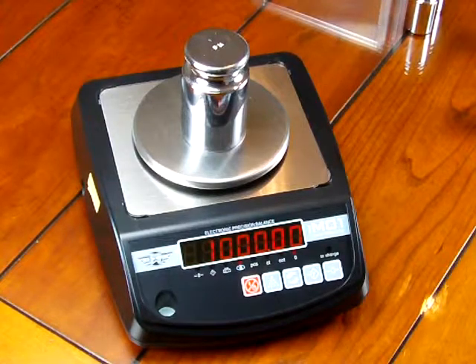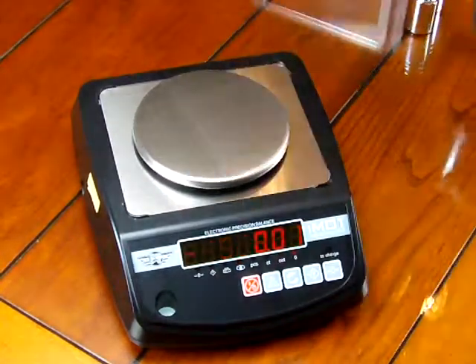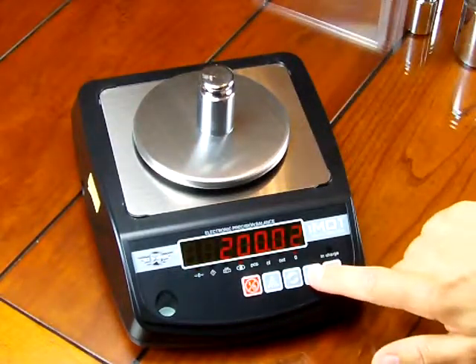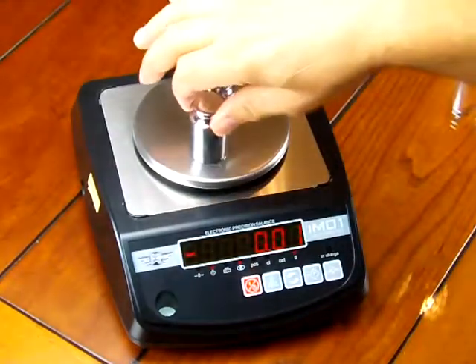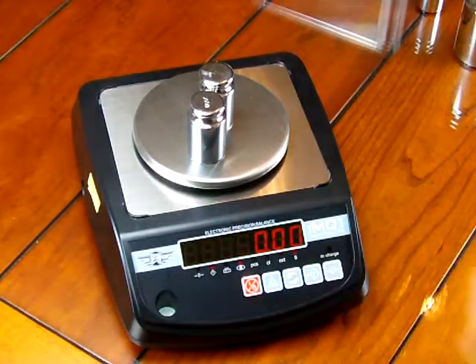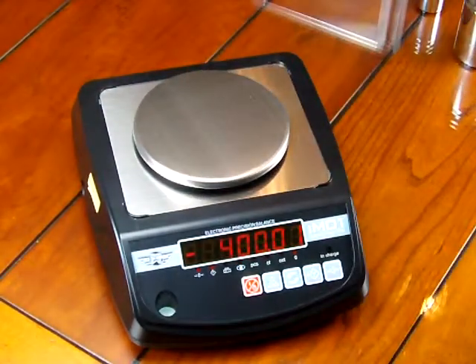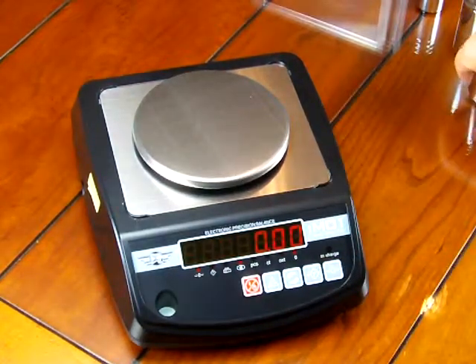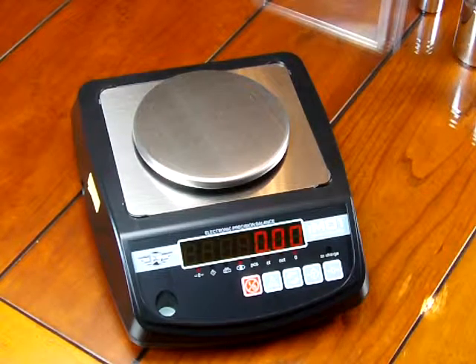The scale also has parts counting. The scale has a tare feature — if you want to tare an item, hit tare and it tares it out. You can put another item on the scale and tare it out again. If you take the weights off, you'll get a negative number. So you can tare to the full weight capacity, which is 1,000 grams. Visit us at www.balances.com or scaleman.com — we are Precision Weighing Balances, an authorized MyWay dealer, and we have these in stock.